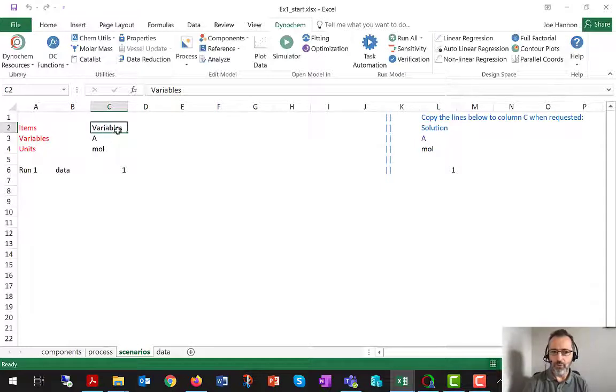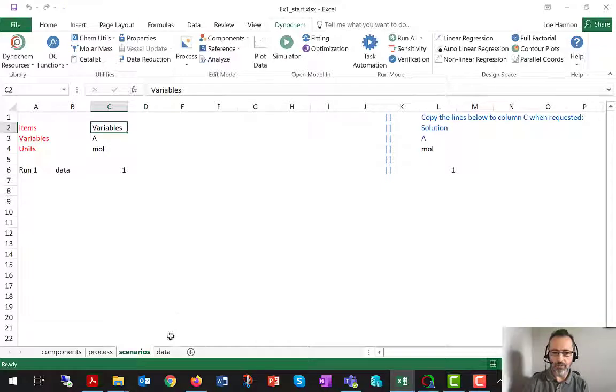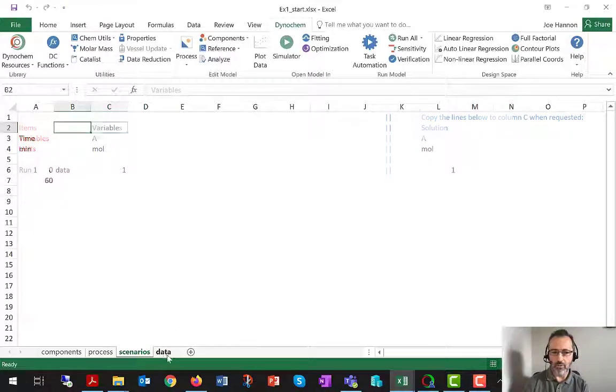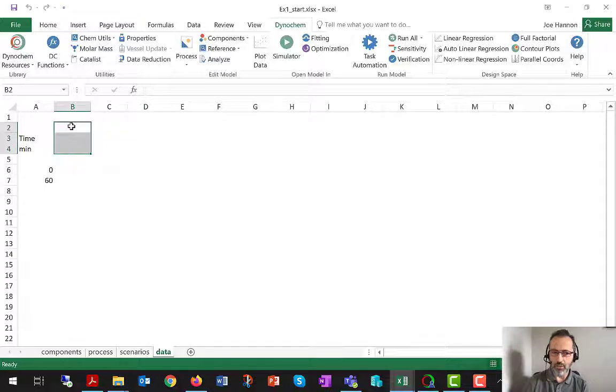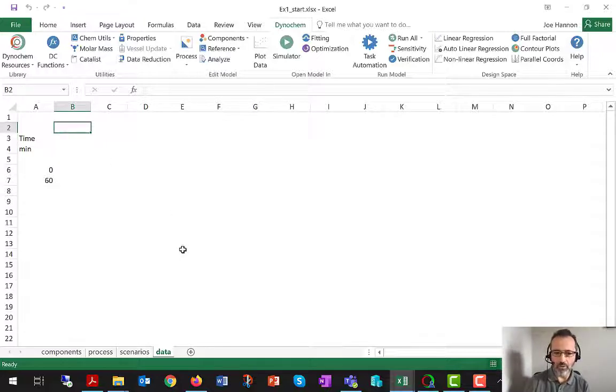Similarly, if we had measured data for the amount of A, we would write variables in the top row of the data header.